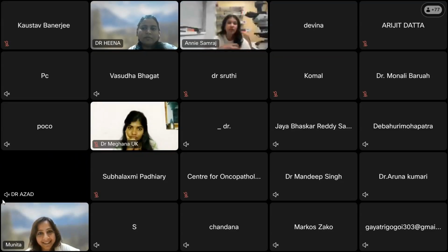We also get a lot of ampullary tubular adenomas and polyps, so maybe we're taking them out at an early stage for the ampulla, and for the pancreatic lesions we see a lot more of the cystic, so we tend to favor the bivalve. Our IPMNs and cystic lesions are much lower.